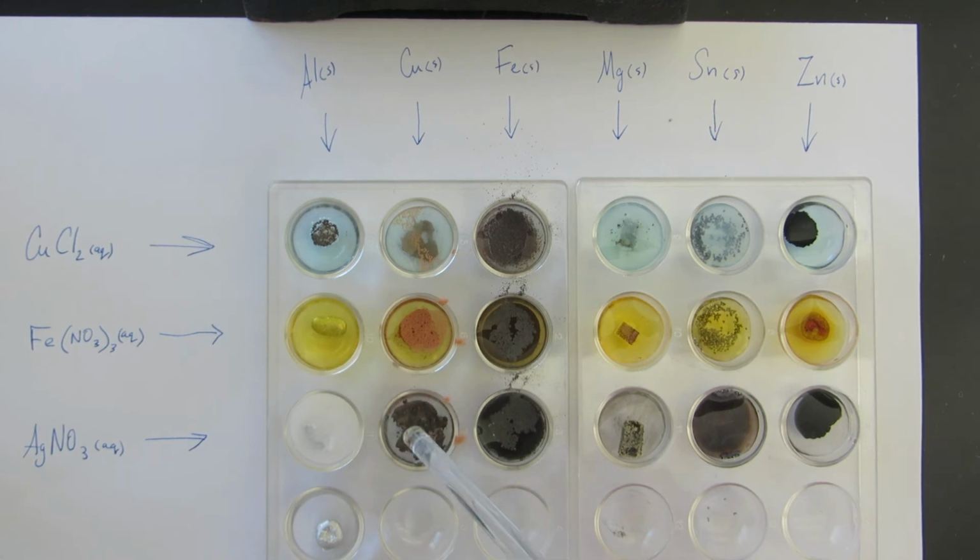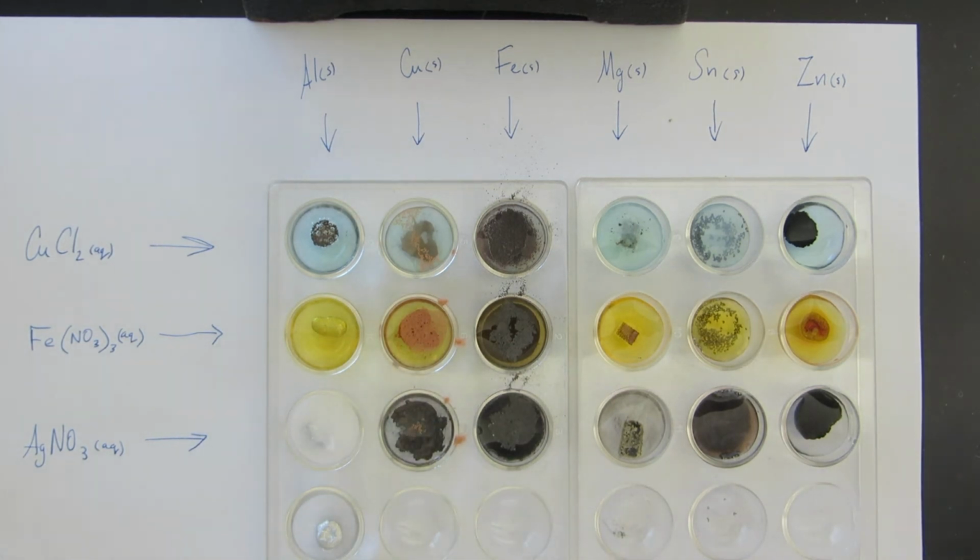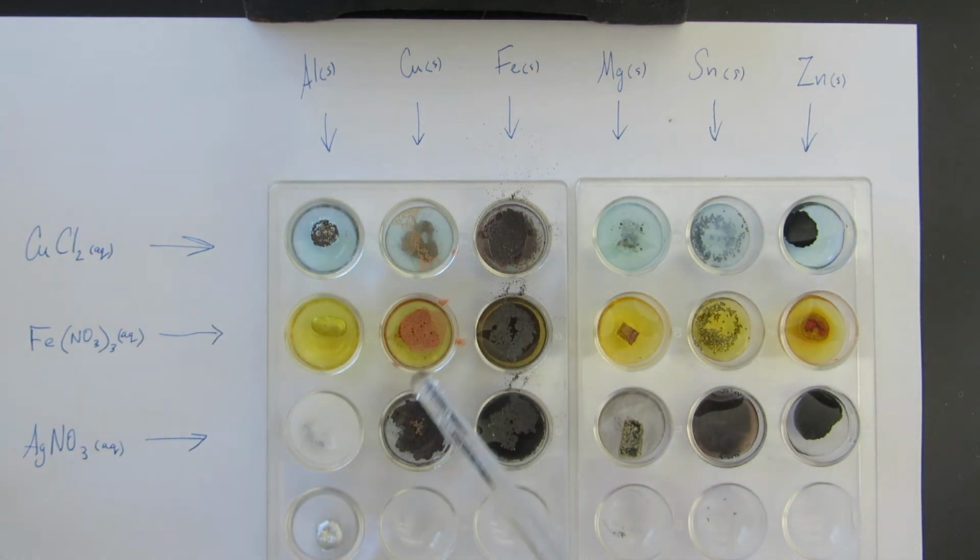I'm just trying to pat down the, it's almost a dust. It's so fine. I'm trying to get it underneath the water surface. All right.